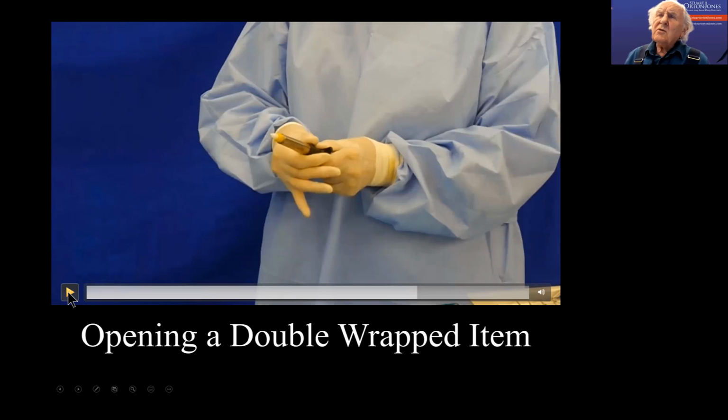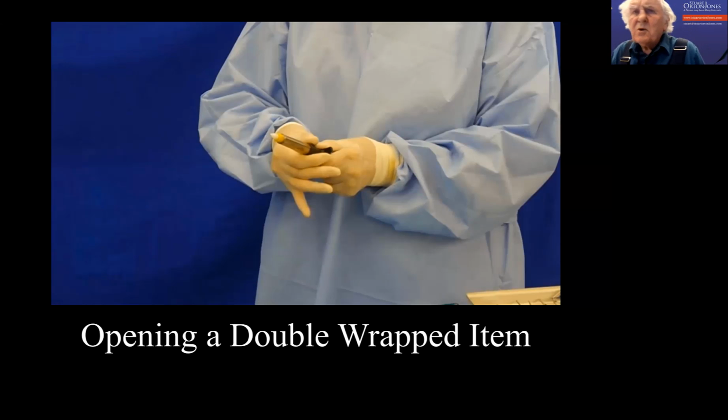You see, my attitude towards asepsis for this sort of work is, if you're going to do it properly, don't make mistakes all the time. And you have to become really aware of when infringements occur in the aseptic field.